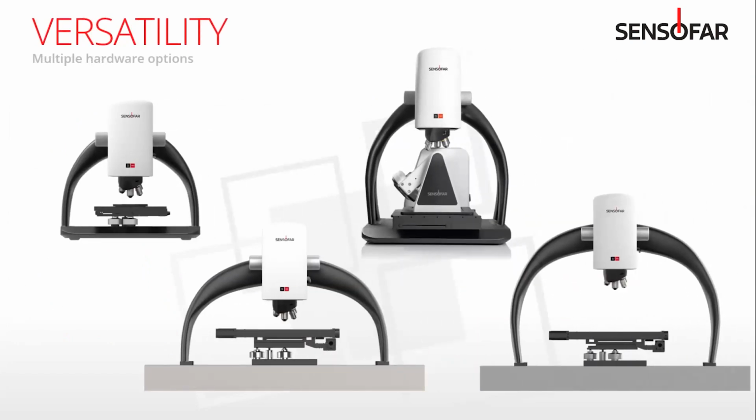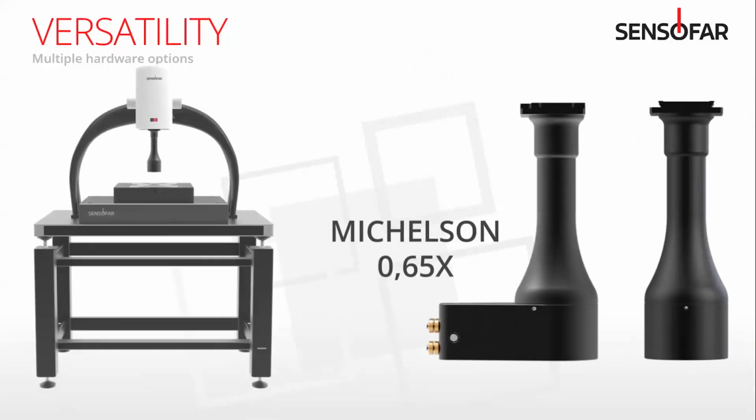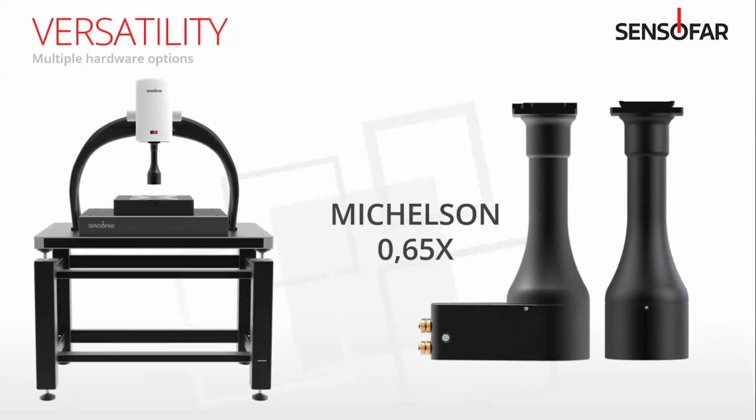But here are some hardware options that you can add onto the system. So if you have samples that are really tall, we can install a high bridge. If you're looking at very large samples, then we can do a wide bridge. We can do a high and wide. The 5-axis, for example, requires a high bridge. Multiple options there. We also offer a 0.65 lens that does interferometry with a slightly different method than our other lenses do, and it allows for very rapid scanning of a large part for bow and warp.